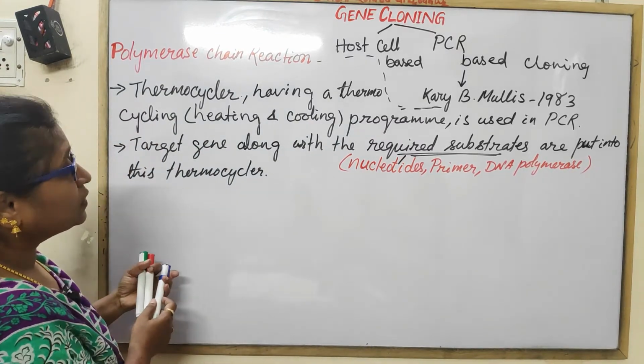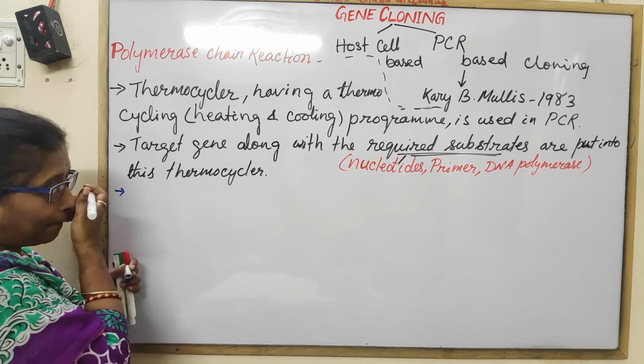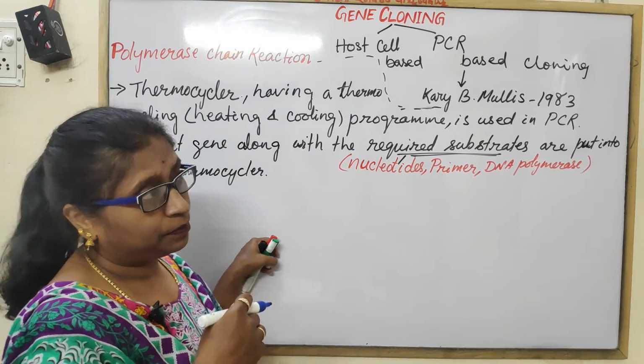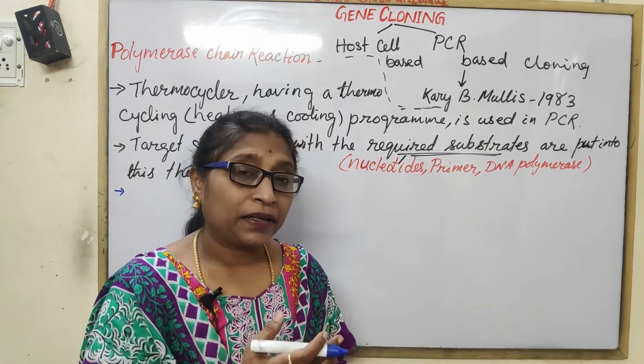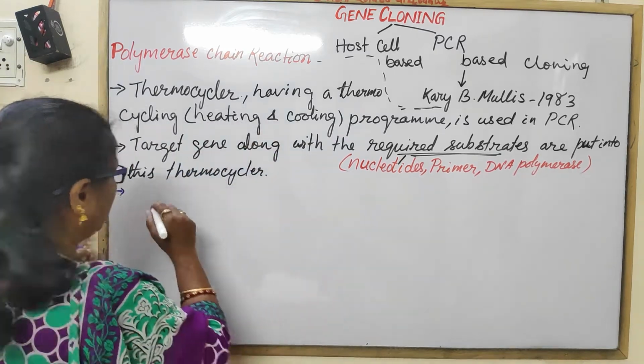In this technique, this PCR reaction is taking place by three reactions, in three steps.